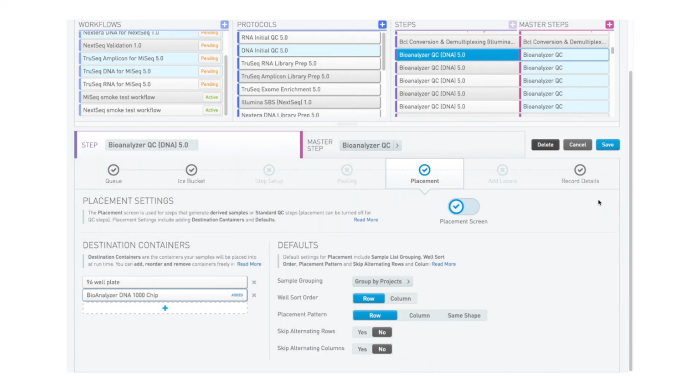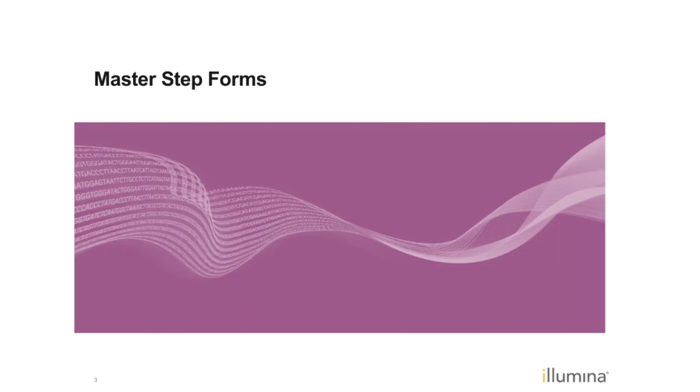So we did that in order to distinguish the things that you just did from what you had previously done. The same pattern will apply when you're on the Q view and you're adding fields to display, or you're on the step settings screen and you want to decide which controls are going to be run on that step. They're all lists that you can have multiple items in. So that plus button that you see is always there.